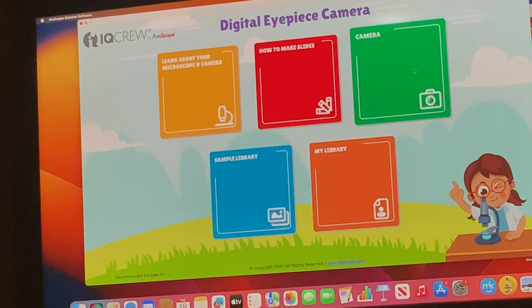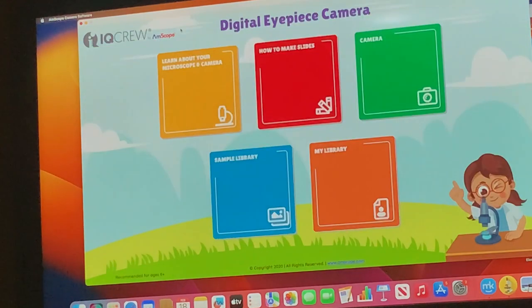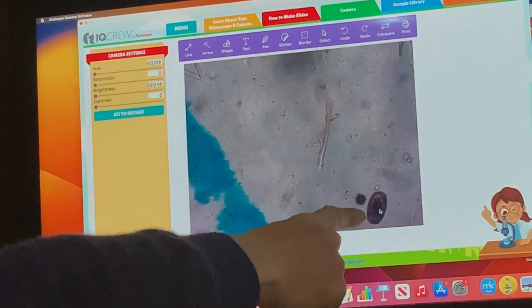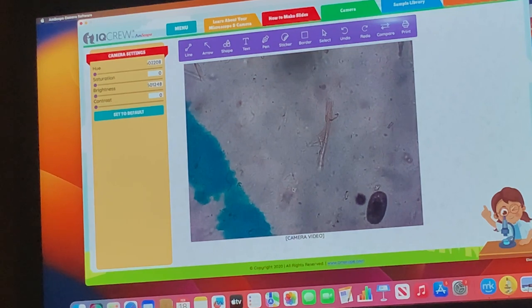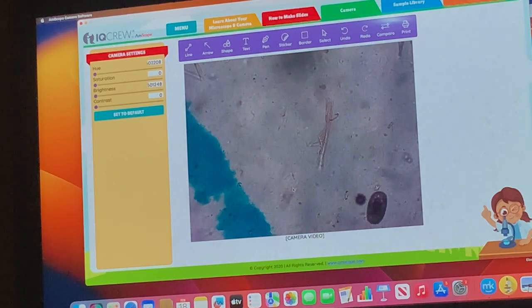In this camera I think I'm seeing it upside down and backwards. There it is again — up there at the top. There it is. You see it right here? This great big huge thing? He's easy to find. That right next to him, the small thing — that's just an air bubble. So this is my question: because I'm not finding a whole lot, is that a good thing? Parasite resistance — I would think you could be harboring as many parasites as you would want to.